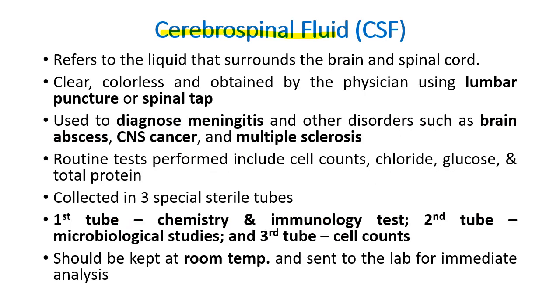Ang CSF naman, cerebrospinal fluid, it refers to the fluid that surrounds the brain and spinal cord. It is clear and colorless, obtained by the physician using a lumbar puncture or spinal tap. Bakit nagko-collect ng CSF? It is used to diagnose meningitis, brain abscess, CNS cancer, and multiple sclerosis.